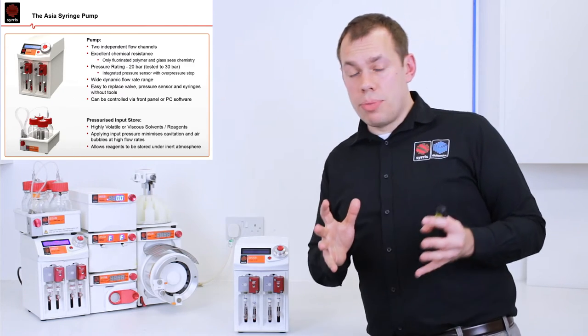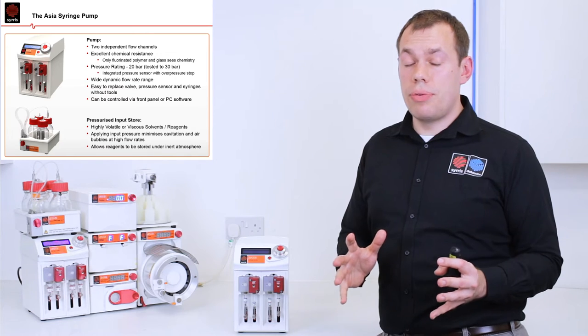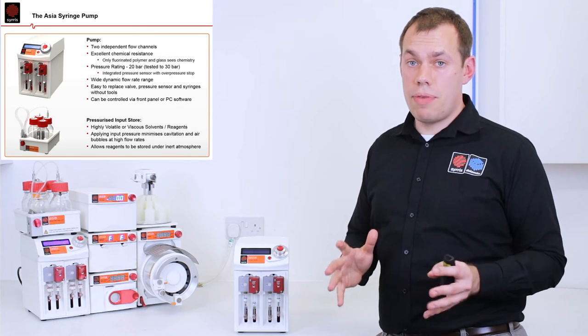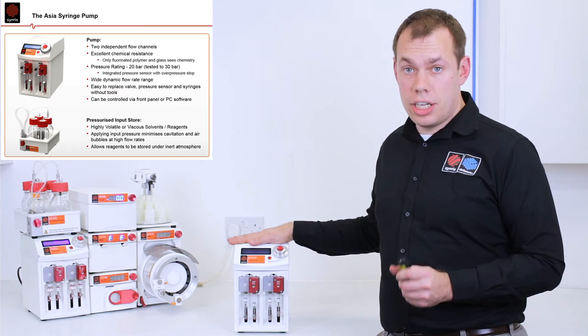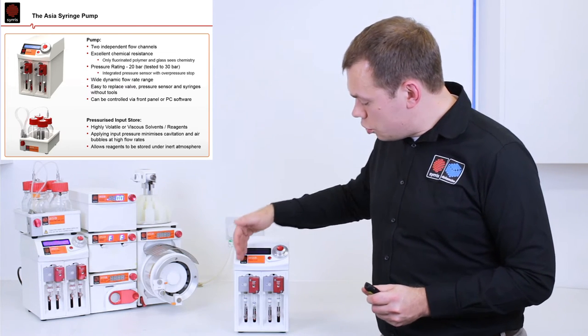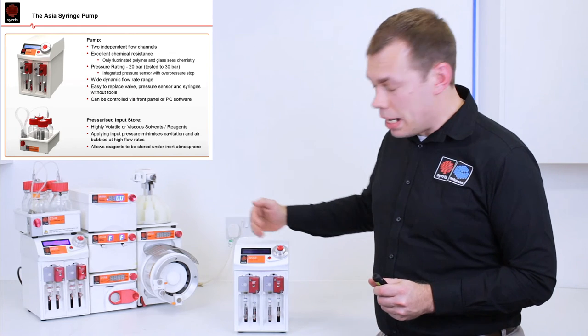So with all those requirements in mind, Cirrus designed the first ever flow chemistry pump specifically designed for flow chemists. The Asia syringe pump. The pump has two channels, each independent.